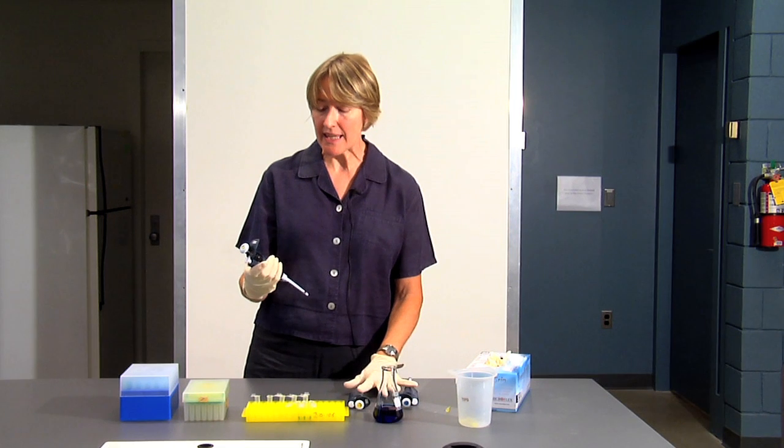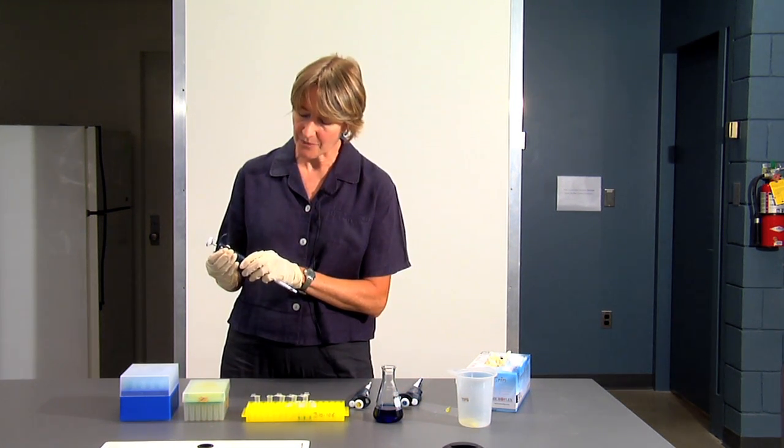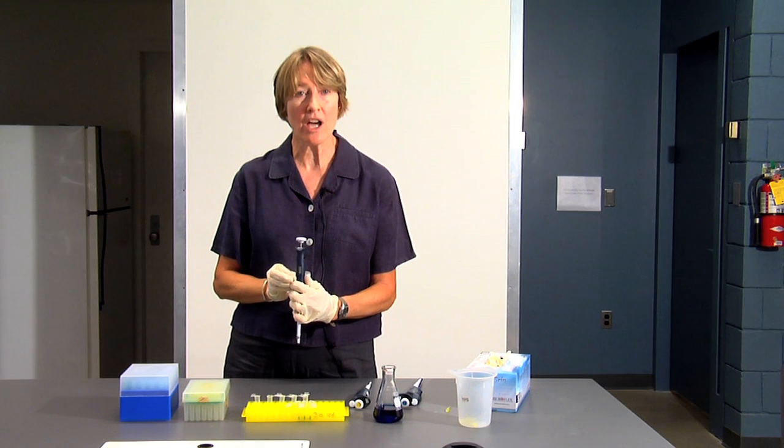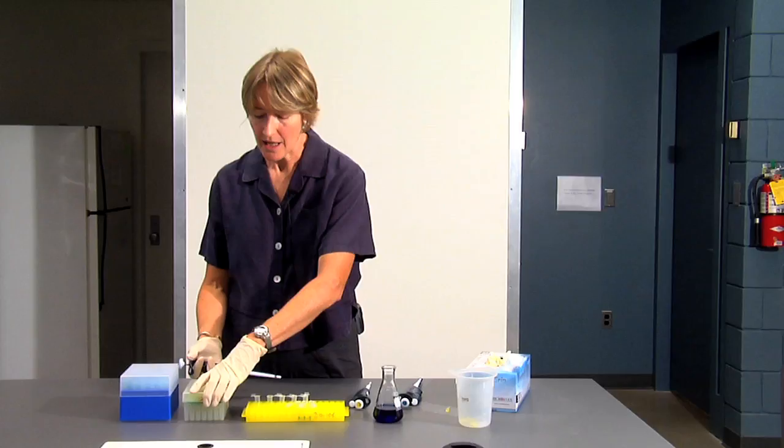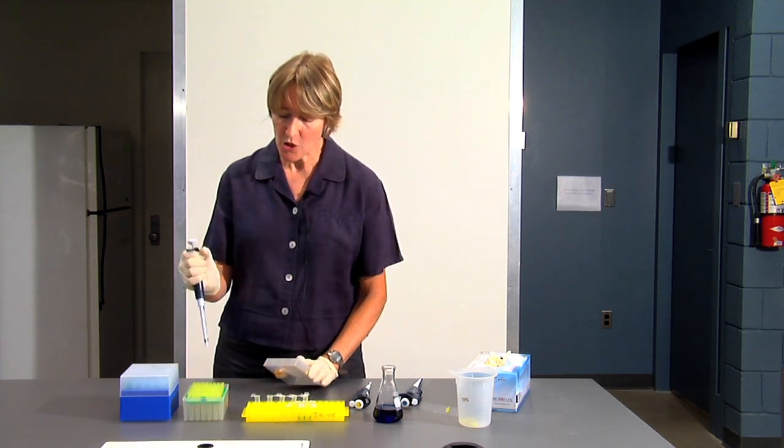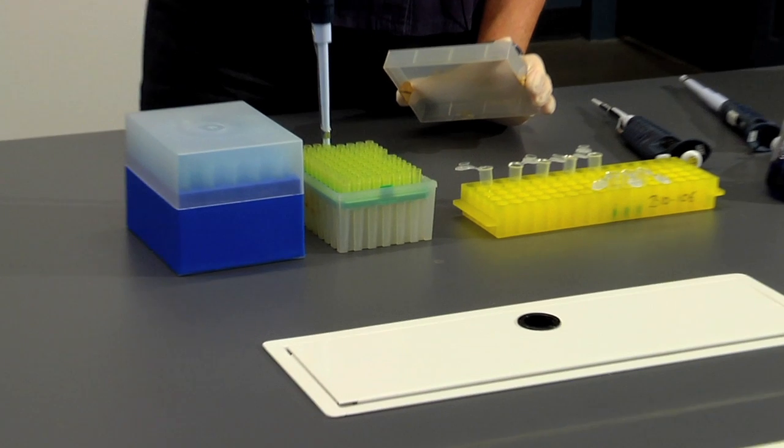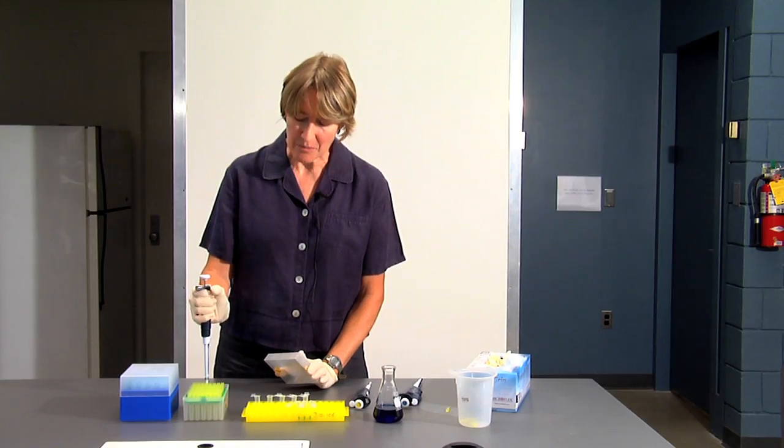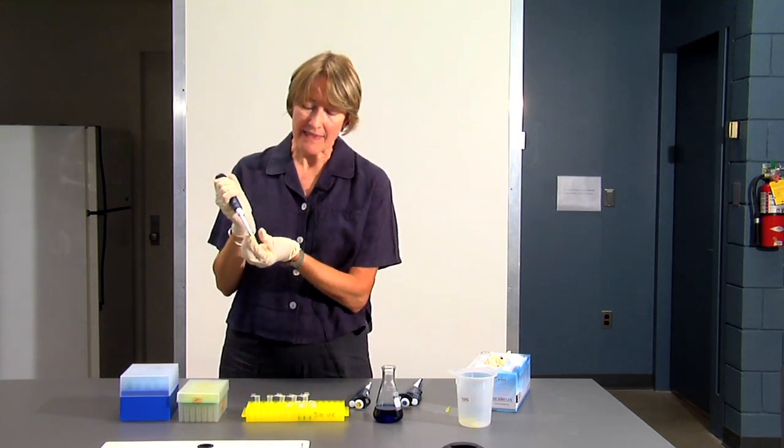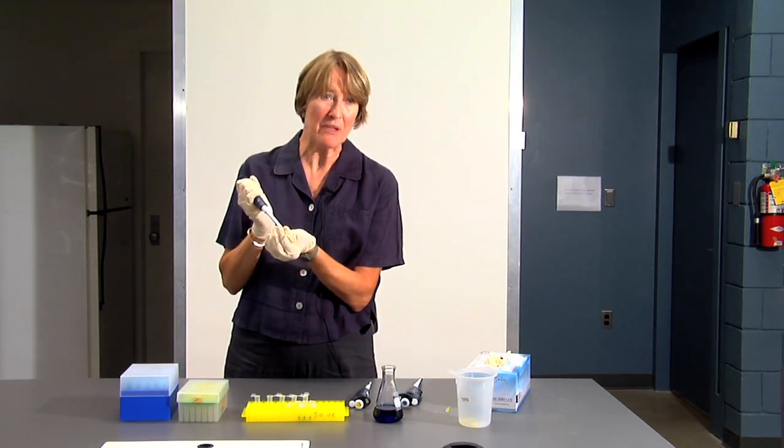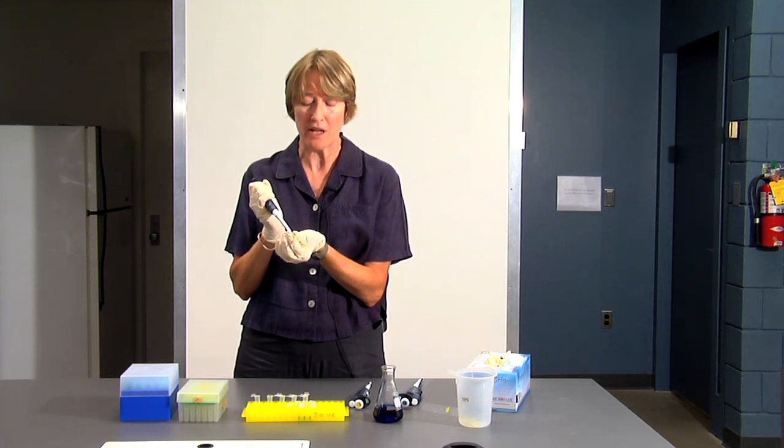I'm going to use the P200, and we're going to pipette 100 microliters. So I've set this to 100 microliters, 100, and I'm going to put a yellow tip on the micropipette. Press the micropipette down onto the tip. You don't even have to touch the tip. Lift it out of the box, and then you just might want to make sure that the tip is tight. You want it to be tight because if it's loose, you might pull up bubbles or the tip might fall off.